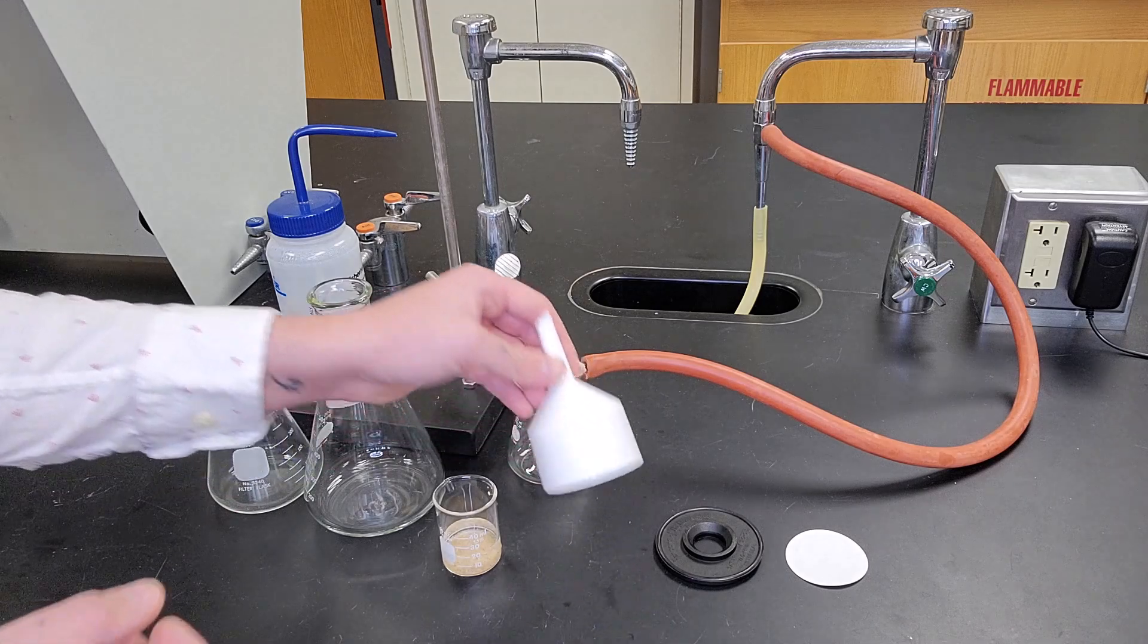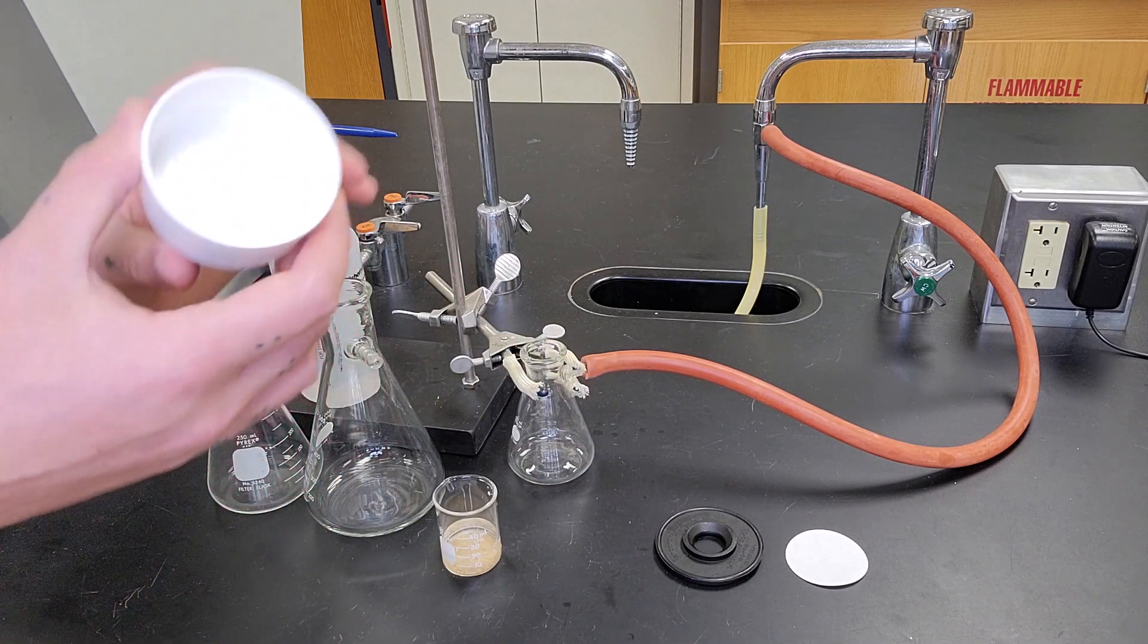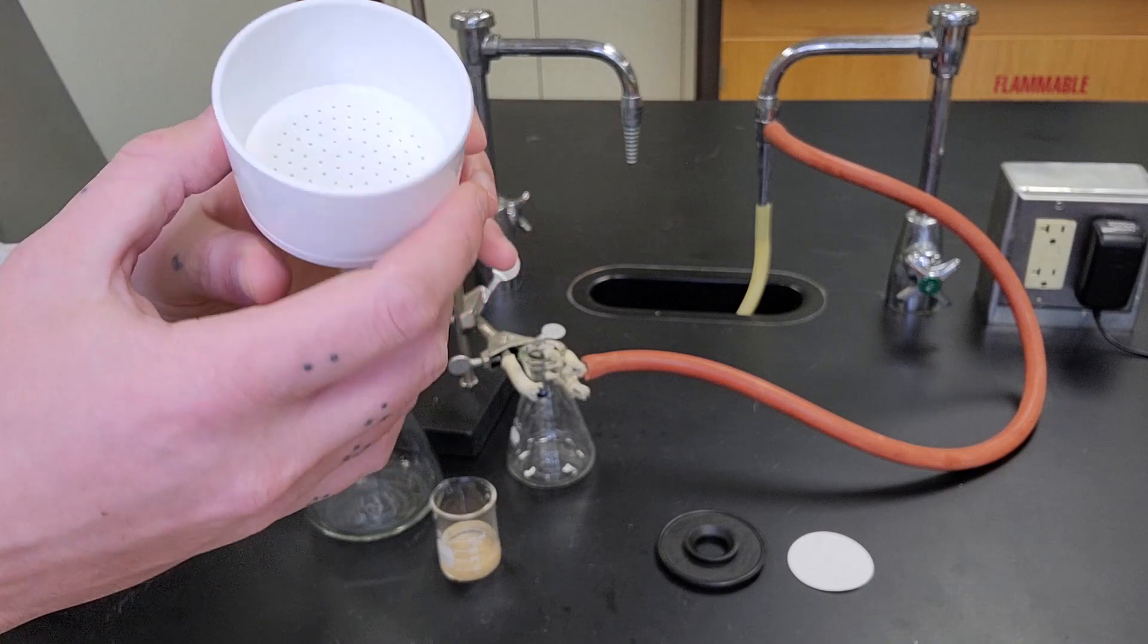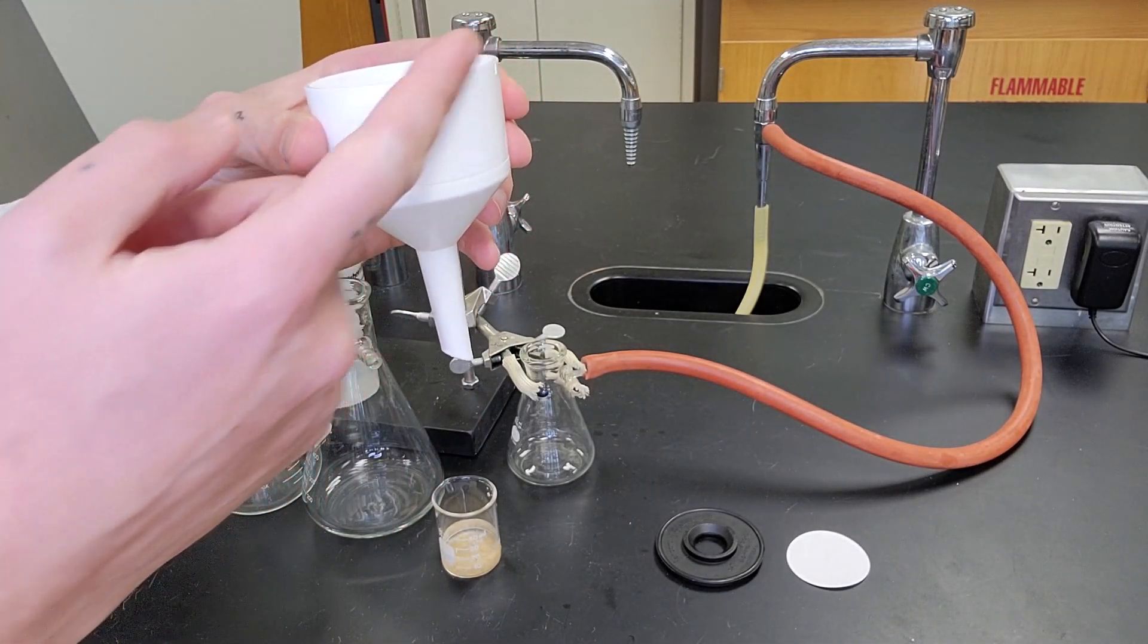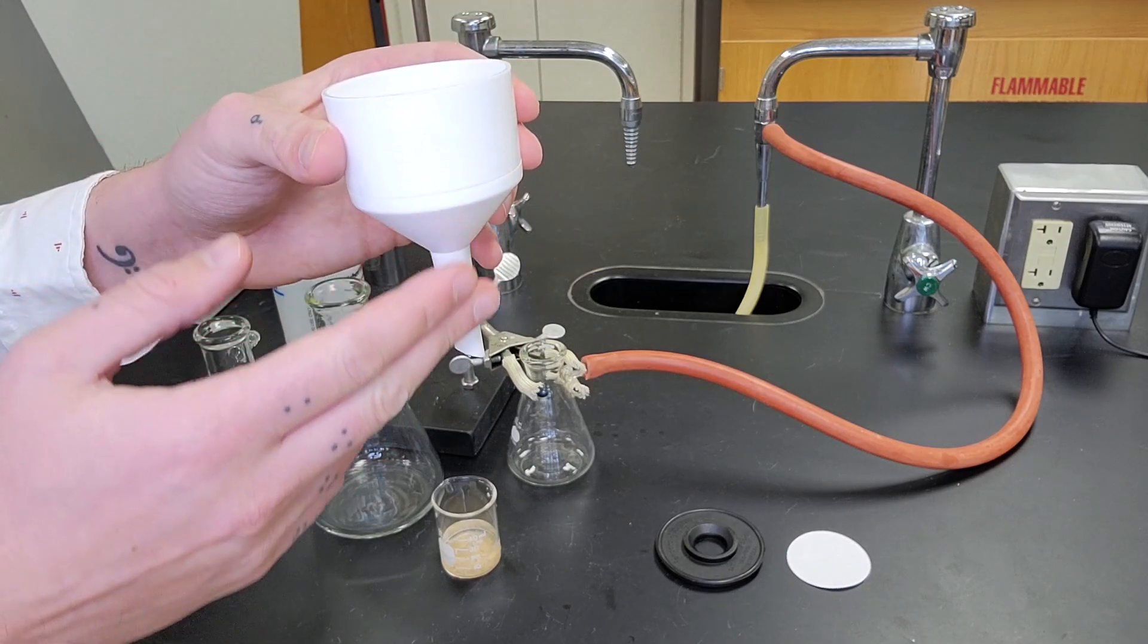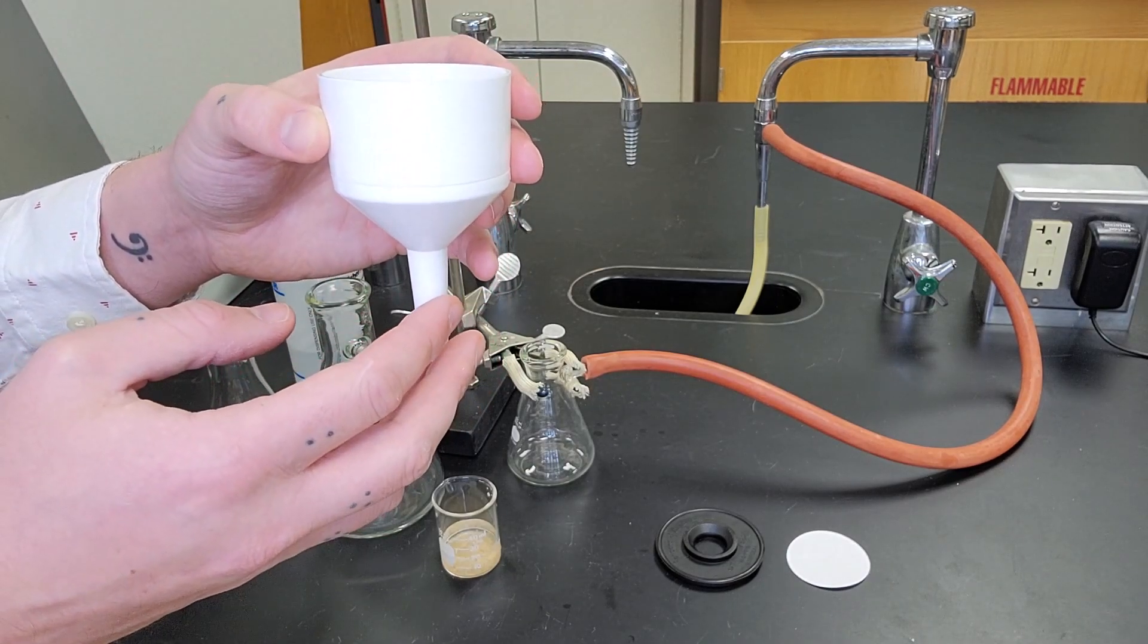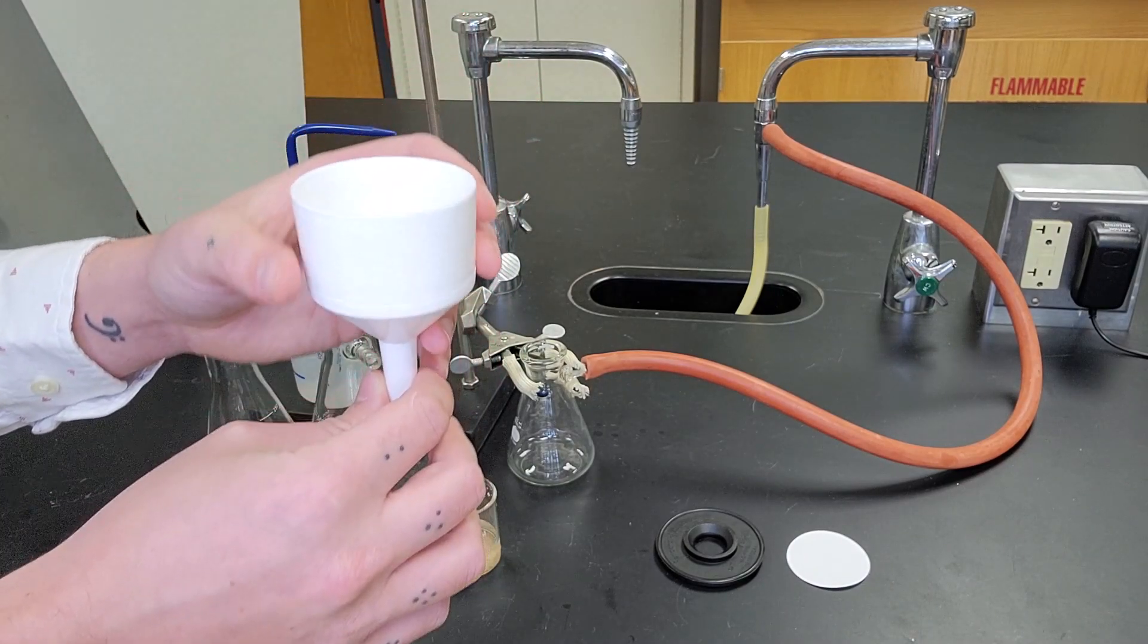Now the piece that actually does the filtering is called the Buchner funnel. The Buchner funnel is similar to a regular funnel where it's got a top part that you can pour into and a narrower end at the bottom to filter into the flask.